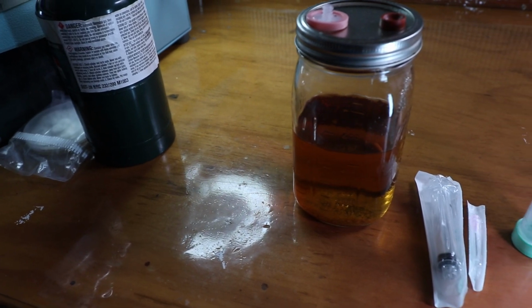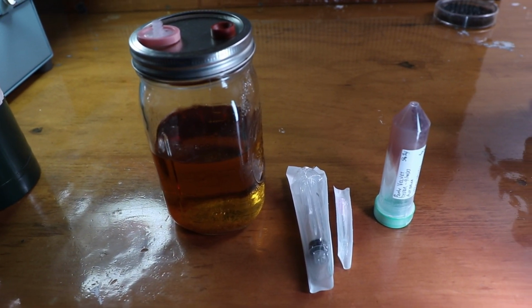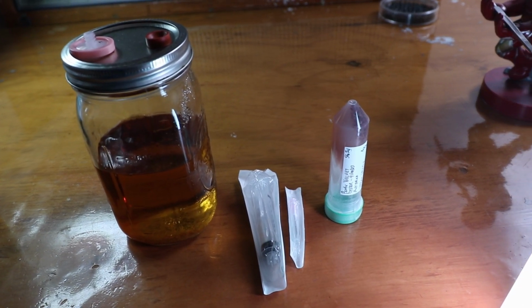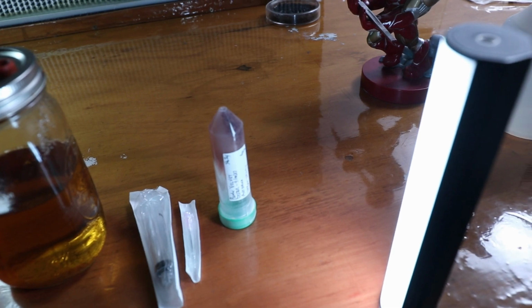You're going to need a few things. You're going to need a jar of liquid culture that's pre-sterilized, your syringe, needle, and then of course your culture plate or your culture slant. And of course, proper lighting.